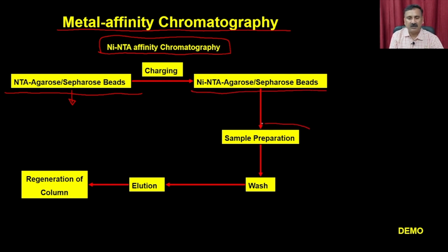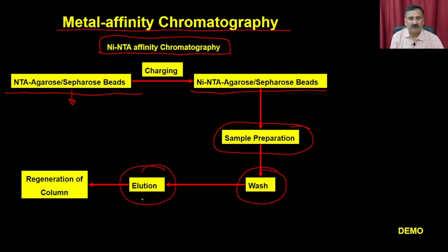Then you're going to load the sample, and then you are going to have the washing steps. And once the washing step is over, then you can do the elution. You can have multiple options. Mostly people are always using imidazole as the ligand for competition.